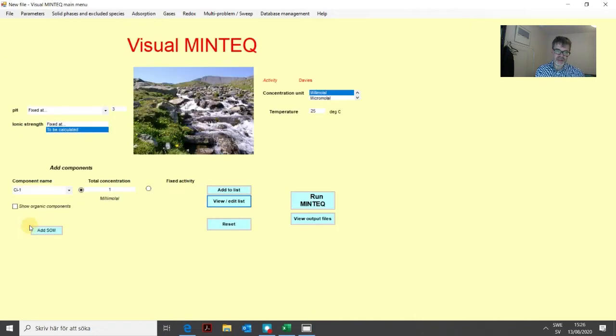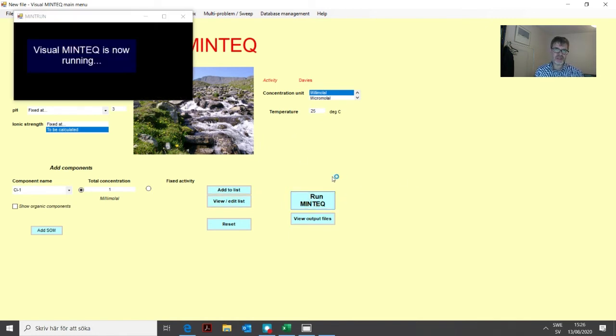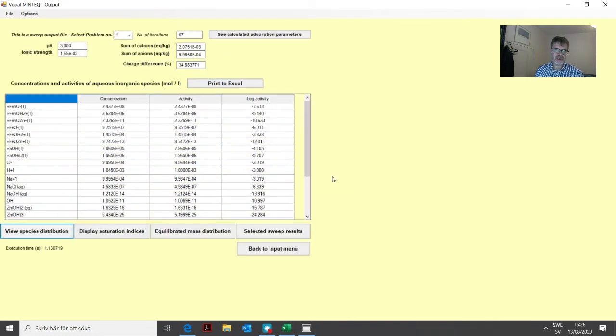We add this to the problem, and we can add other things we might be interested in, but we'll just add the zinc total sorbed for now. Then we click save and back. Now we have set up the problem, so we can run it. We click run MinTeq.